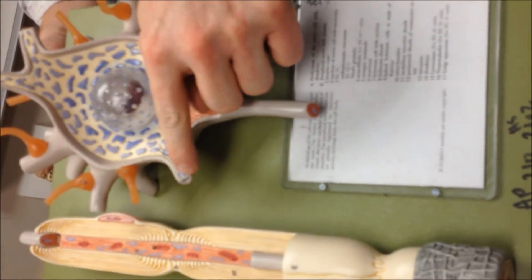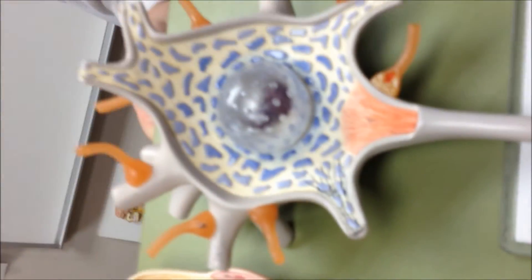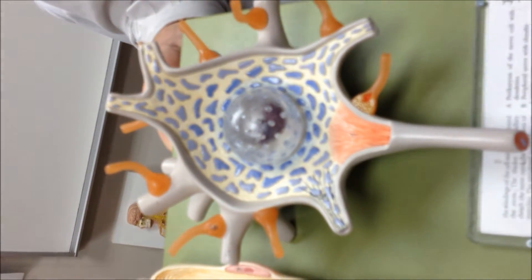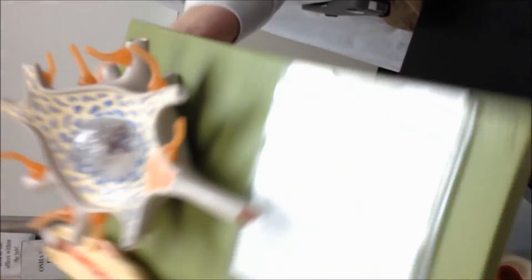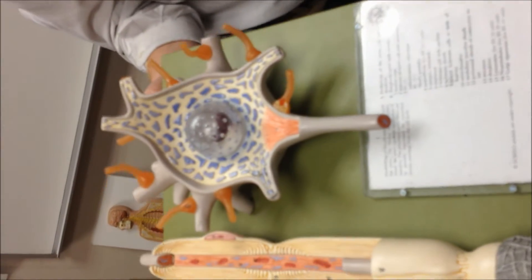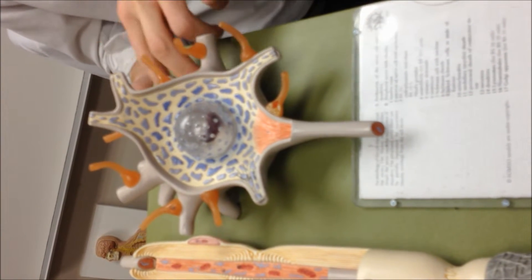What black lines? Little black lines right inside there. Okay. All these little porcupine looking things on the back here are the dendrites taking the incoming calls to the neuron. Can you point to them again? Yeah, all these little porcupine, little spines here, dendrites. The orange ones? The orange ones are the axon terminals that are delivering the message from other neurons to this neuron.